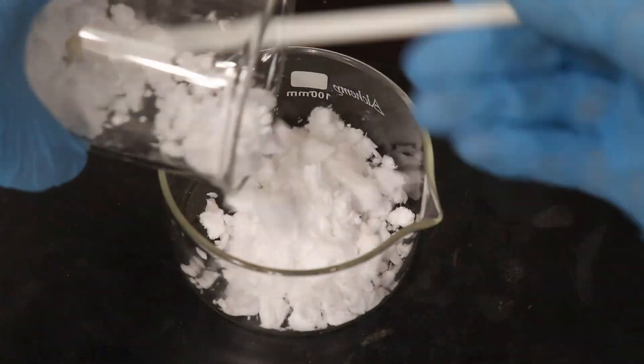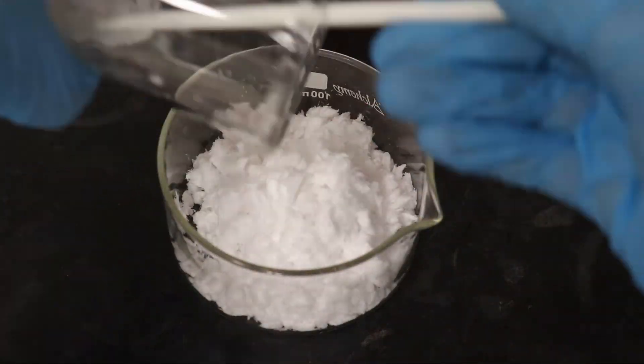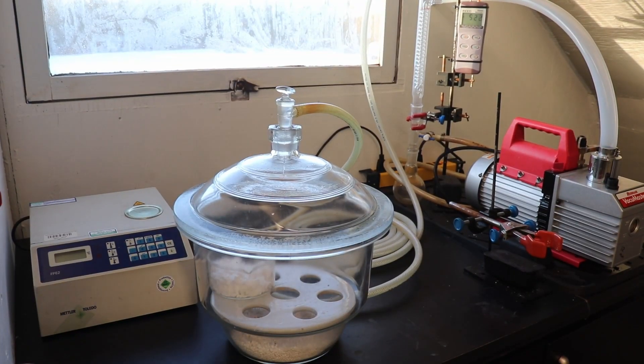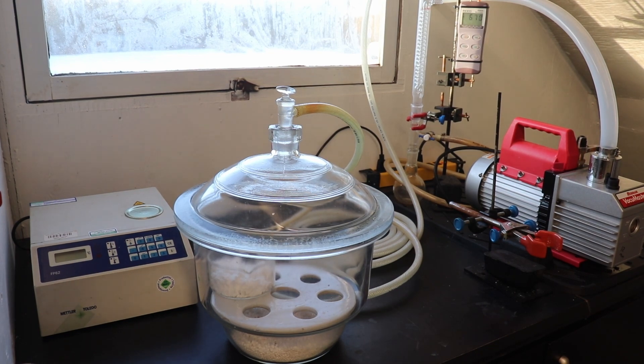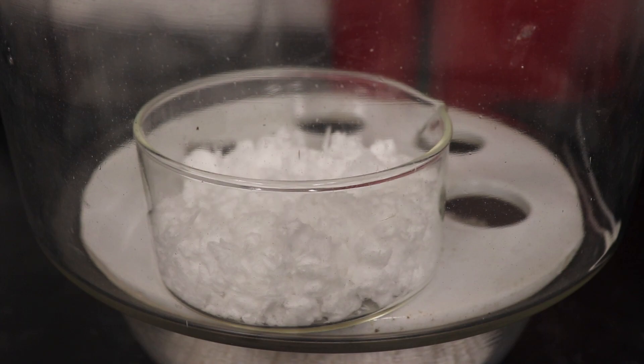The product was then transferred into a crystallizing dish and dried in a vacuum desiccator overnight over calcium chloride. You shouldn't air dry this product as it is an anhydride and is susceptible to hydrolysis from atmospheric moisture.